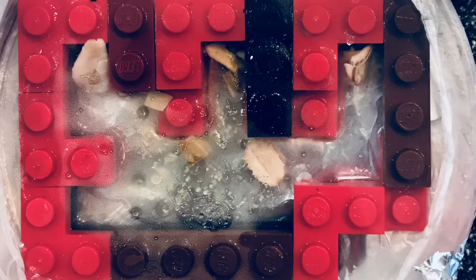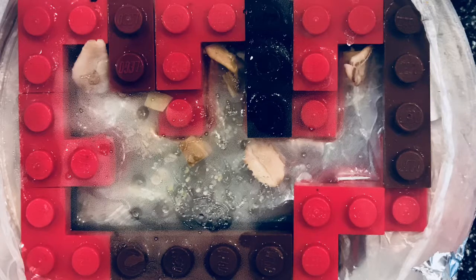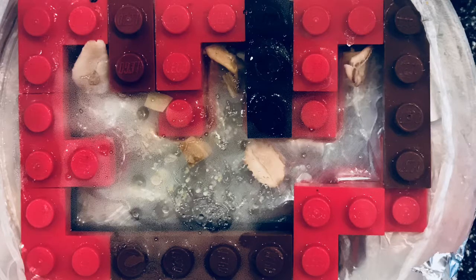At this point in the experiment, you can see that the cultures have not grown outward. One other important thing to note is that the cultures change from a bright yellow to a more brown hue, which hints that the cultures have begun to die without a food source.